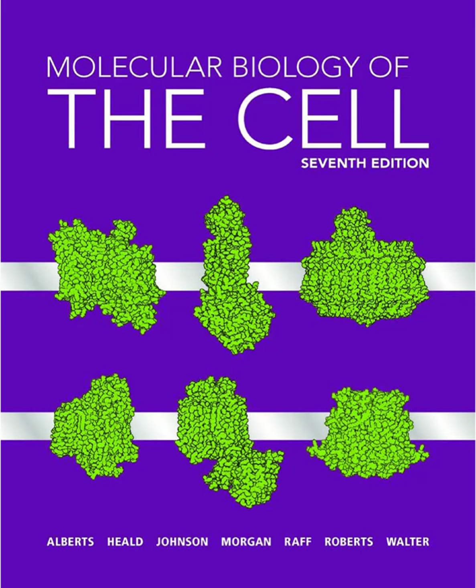Got it. Is there anything else limiting what we see, especially with faint signals? Oh, yeah, definitely. Photon noise. Think of images as being made of particles, photons. Detecting them is a bit random. It's statistical. If the light is dim or you take a really short exposure, you get these random fluctuations in the number of photons hitting each spot on your detector. It looks kind of speckled or noisy.